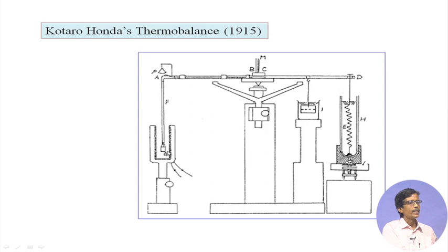If there is a weight change, that means slowly the weight is reducing, and that can be monitored over here. Some damping arrangement is also there. So, on the right hand side, how much it is tilting from the original position is basically monitored for your weight change.